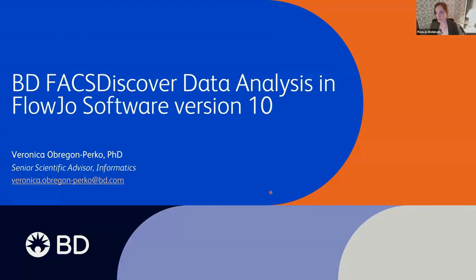I'm going to spend a little bit of time in the slide deck today, introducing the outline of how our hour together will go. Then I'll do the rest of the demonstration in the software itself. I think some of these concepts are easier to grasp when we can see them in action versus walking through slides in a slide deck. So we'll start with the slide deck just to introduce some things, and then we'll move on to the software. Okay. So let's go ahead and get started.